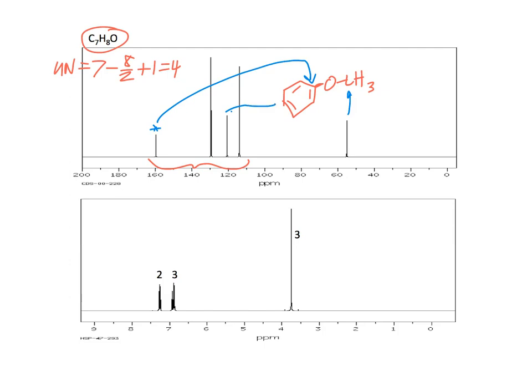The short one here is going to go to the end, because even though we can't integrate them, those are similar kinds of carbons, and we see it's kind of a 2-to-1 ratio. And the other two, it turns out that the most upfield one is going to be next to the oxygen, and the downfield one is going to be further down. So we can tell the one next to the oxygen is the most upfield based upon some resonance.